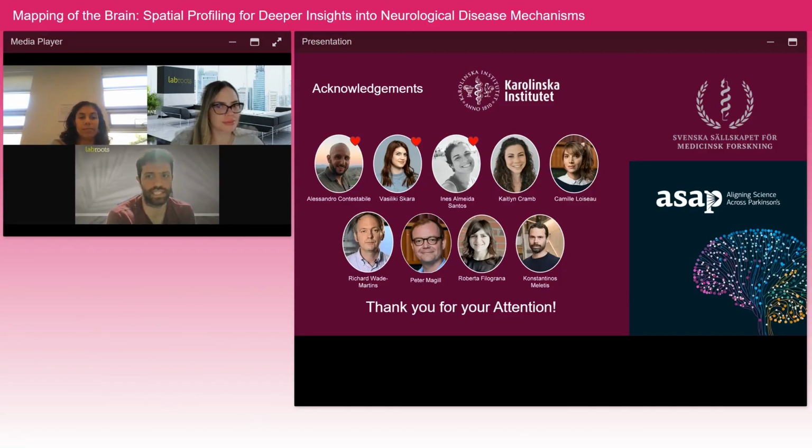But when it comes to CSF, ANXA1 is pretty highly restricted to dopamine neurons, but at the same time, it's also expressed in several tissues. It's not in neurons so much, it's mostly in pia and ependymal cells. And that makes a problem, because you might find it in the CSF that is not really coming from dopamine neurons themselves.